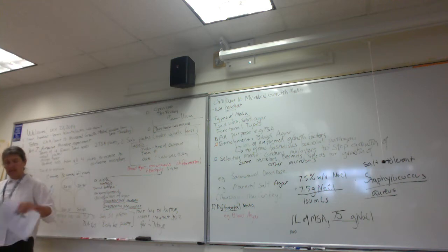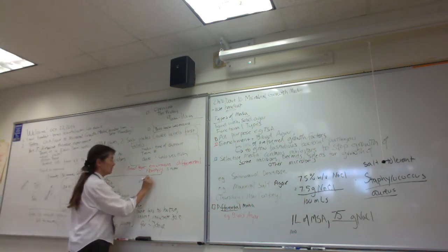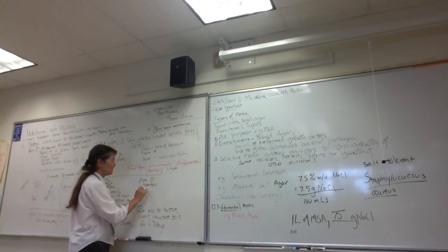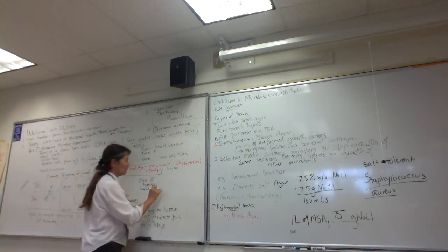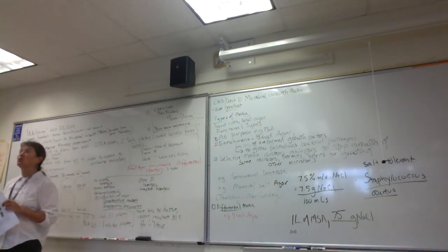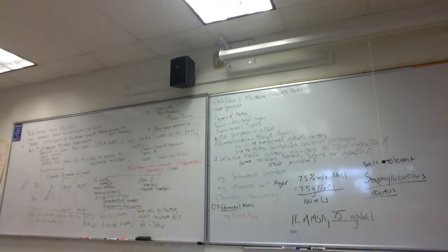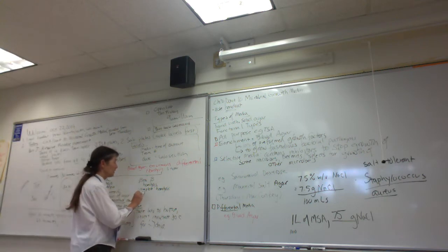Okay, guys. So, folks, what's the second type of hemolysis that Audrey has described here? Beta hemolysis. So we use the beta symbol. And beta hemolysis, you guys, is described as complete hemolysis, meaning not only are we going to break open the red blood cells, we're going to destroy the contents. So it's just wild, you guys. The agar becomes clear as glass. And a really good beta hemolytic colony, you could lay the plate down on top of your textbook and you could read through the area of beta hemolysis. That's classic, right? So it's complete clearing. It's actually clearing of the agar, clear as glass.